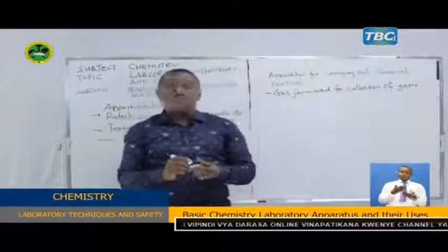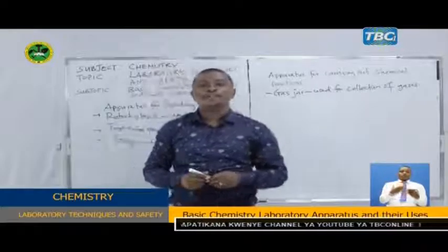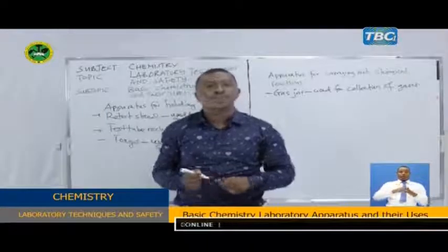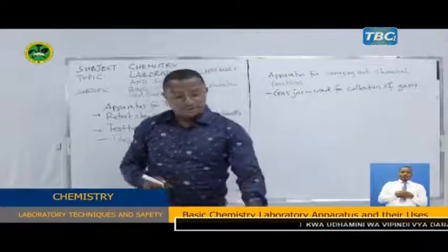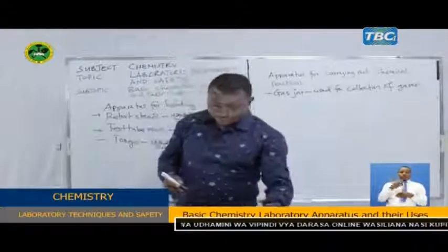A gas jar is used for collection of gases, and also it is used for carrying out some chemical reactions that involve formation of gases, such as formation of oxygen. Oxygen is always collected in a gas jar. So this is the gas jar used for collection of gases.